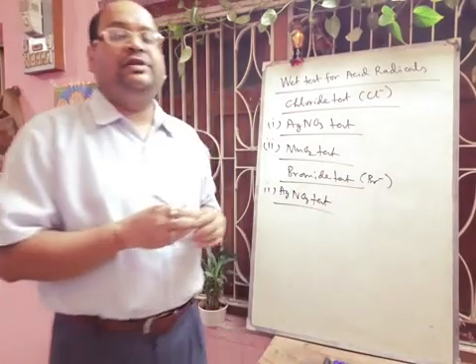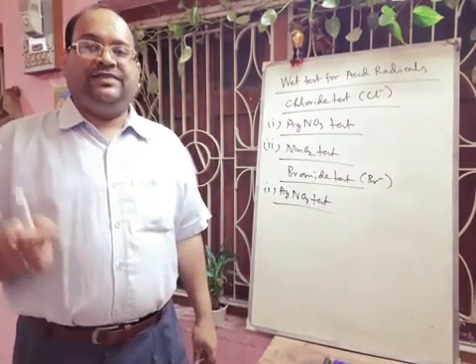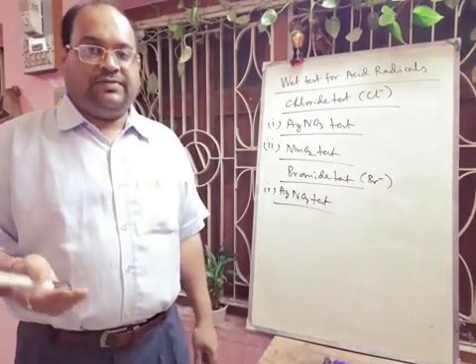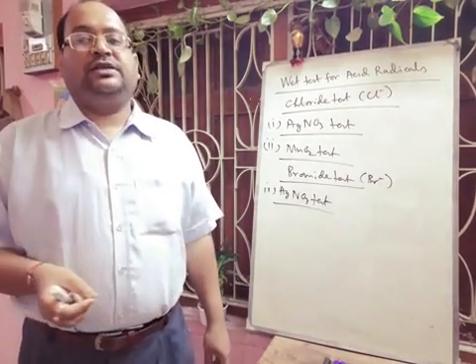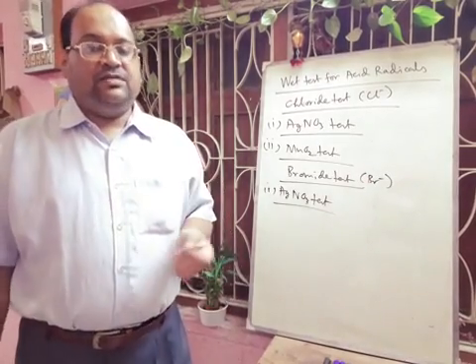Here also we have to take 2 ml of the sodium carbonate extract. Then it will be acidified with dilute nitric acid. Then carbon dioxide will be boiled off. Then you have to apply heat, and then we have to cool it. Then a few drops of silver nitrate solution will be added, and then you will get a pale yellow precipitate.